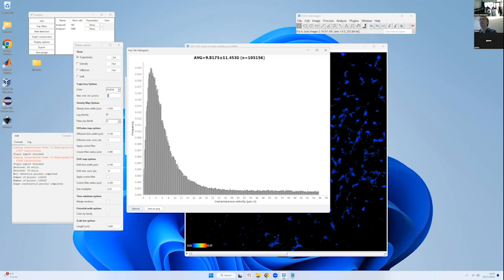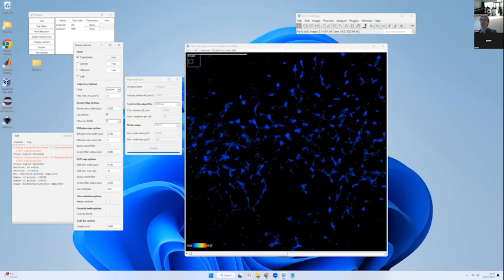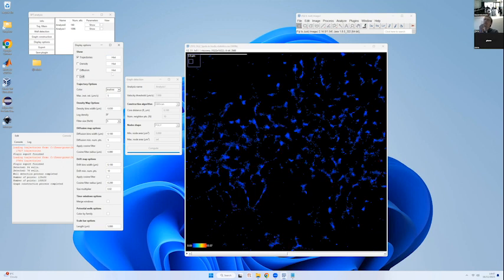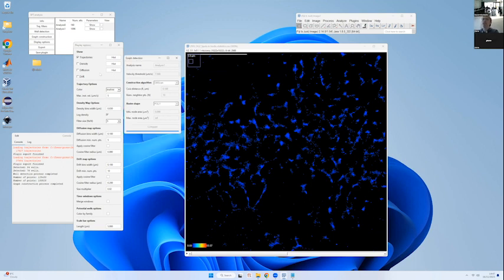No, I do not do it. If you want to select the threshold, it could have been good to have this distribution of velocity so that you can decide yourself. We never did it this way, but we could.